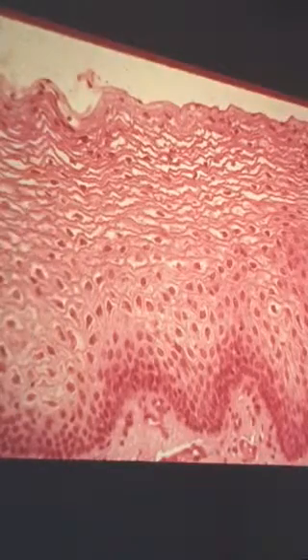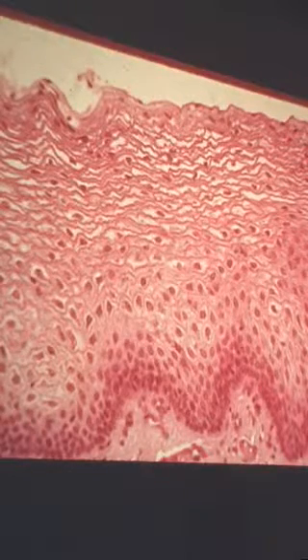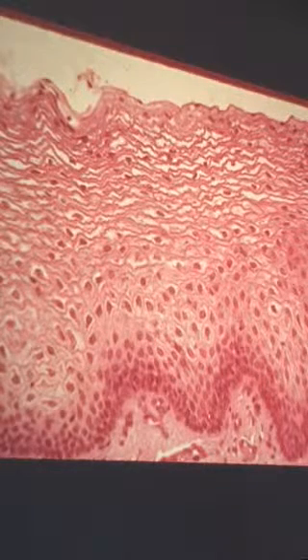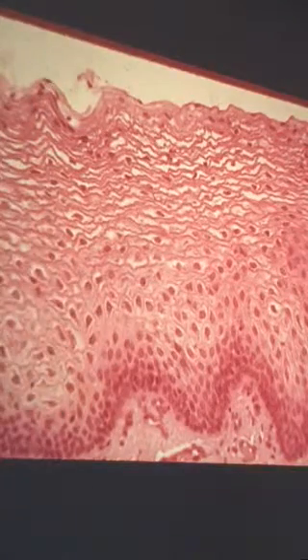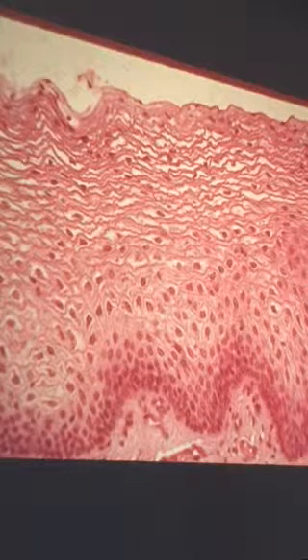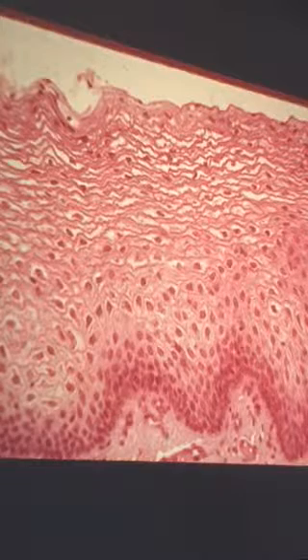And how about this? How would this be classified? This tissue from there up to there. Well, that'd be a good one to put on a lab practical. Okay, it's non-keratinized stratified squamous epithelium. And the layer that we have right in here would be what? Stratum spinosum, and this would be then what? Stratum intermedium, and then the stratum superficiale.